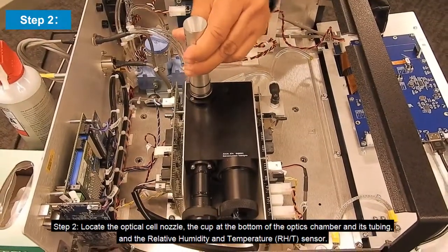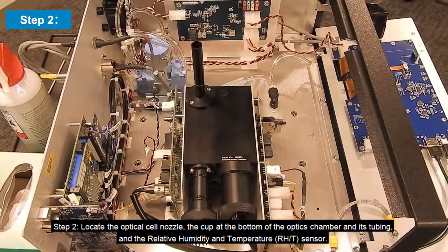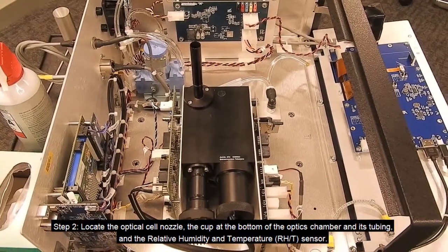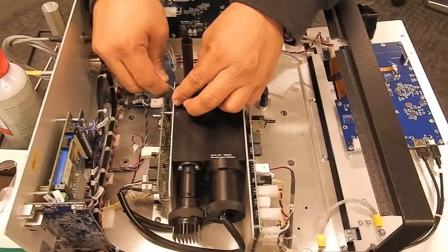Step 2: Locate the optical cell nozzle, the cup at the bottom of the optics chamber and its tubing, and the relative humidity and temperature sensor.